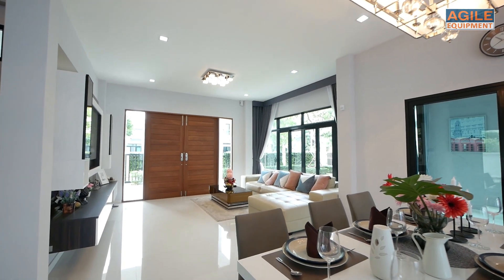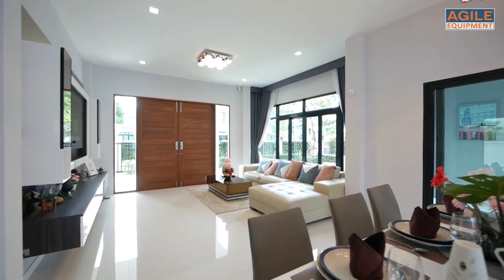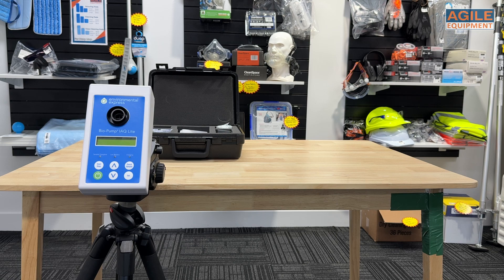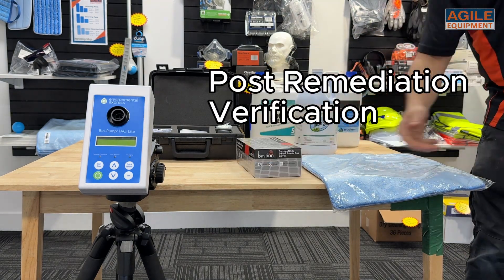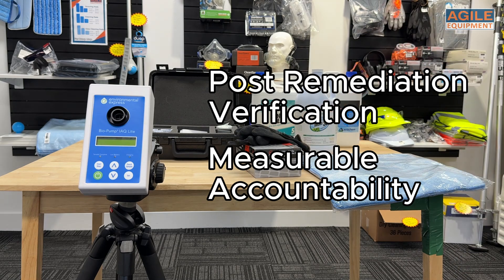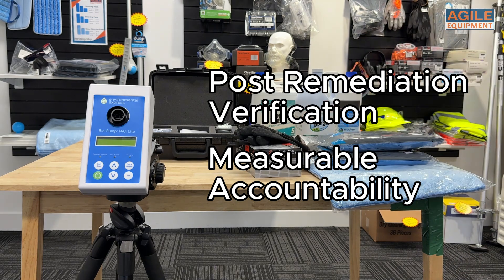You'll get a detailed report, making it easy to confirm whether remediation was successful or not. This process is especially helpful for restorers needing post-remediation verification. It adds a level of professionalism, standardization, and transparency to your work.